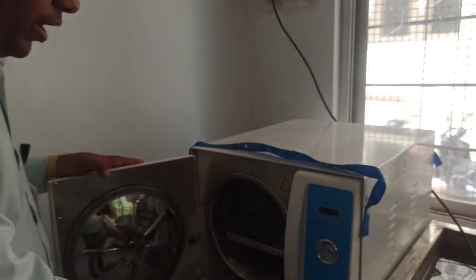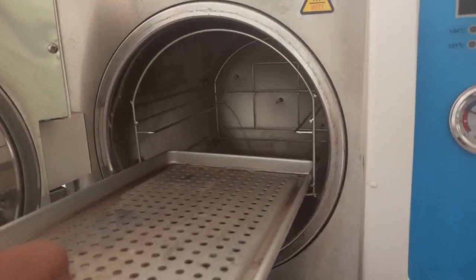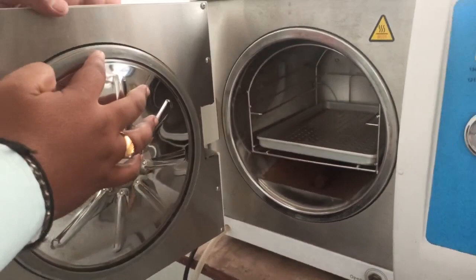First of all, let's open the lid — the lid is opened like this. This is a 20-litre Bio Era autoclave. You can see here this is the inner compartment. This is the tray in which you are going to keep your glass wells, and below is the water tank. You have to fill the water till this level, and then this lid has to be closed. You can see the lid has a gasket around it to create an air-tight atmosphere.